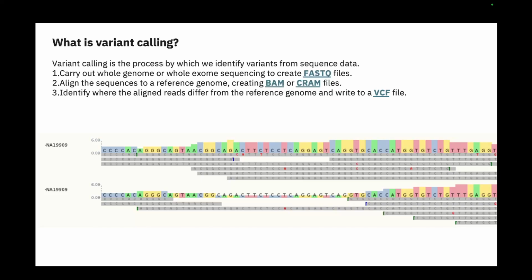So what we do is we take a consensus. In this case, only one read is telling you there is a C in this place, but the rest of the reads are telling you there is an A. So most probably there is an A here in your sample as well, and this is just a sequencing error or some sort of error that has been introduced. So we look at multiple evidences of this change in nucleotide in the sample compared to the reference, and that is how we find different types of variants.